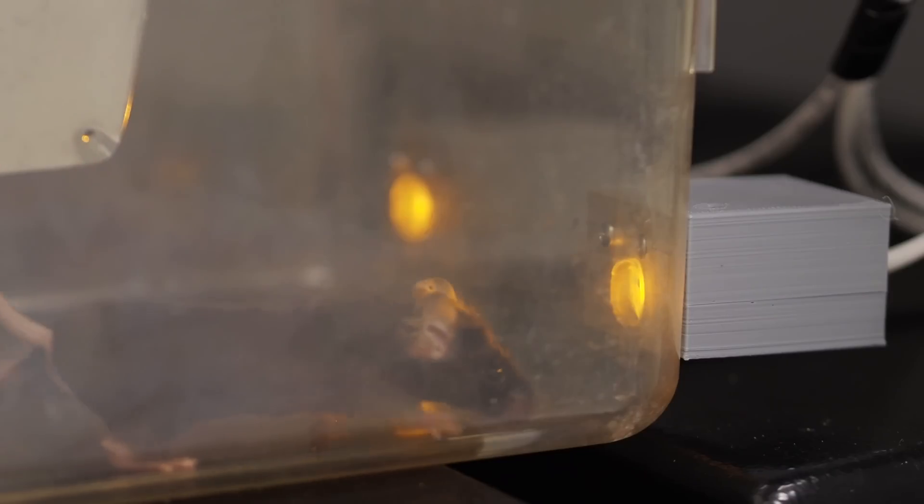The environmental control chamber is used to measure how neurons in a mouse's brain react to rapid temperature changes, and they can actually see that information live. But they also built a nose poke chamber where they can monitor how mice behave, whether they want more heat or are content as is.